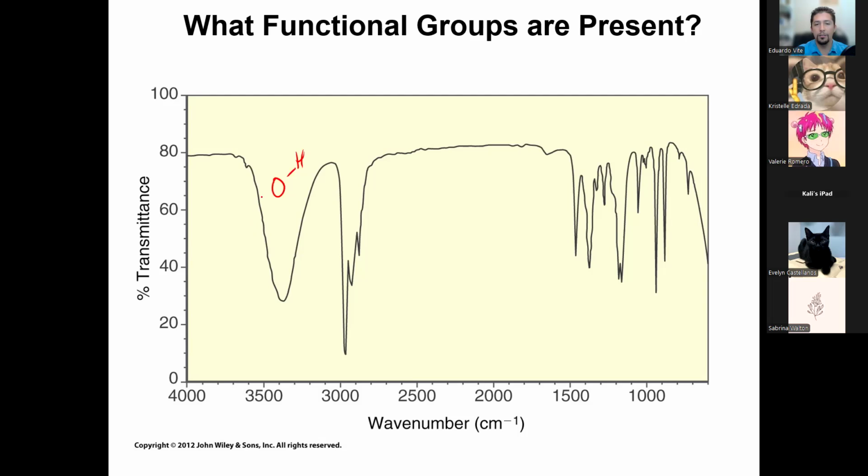How else can you tell? It's relatively smooth, right? It's not very sharp. It's broad. And notice that in a carboxylic acid, the breadth, the width, is 1000 wave numbers. Here, you're starting at like 3200 and you're finishing off by 3500. So this broadness is a lot less than the broadness of a hydroxyl from a carboxylic acid. But this is still an OH signal.